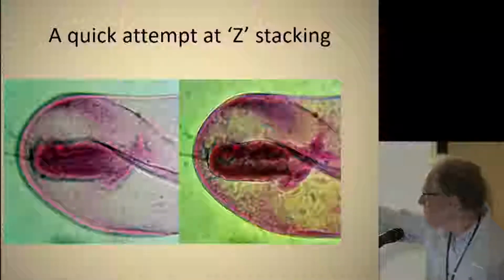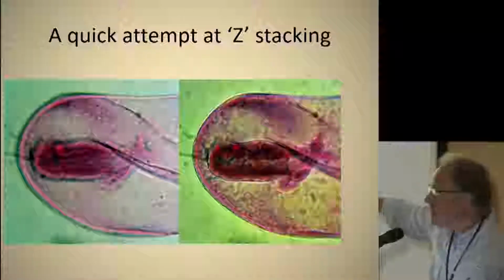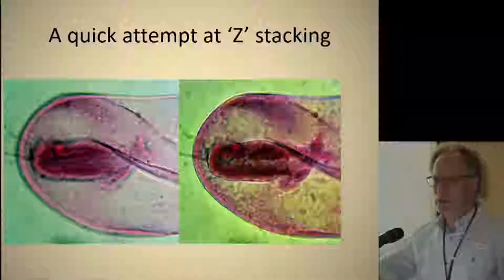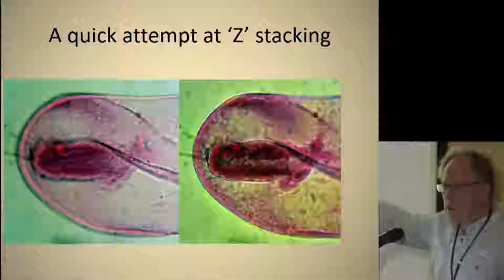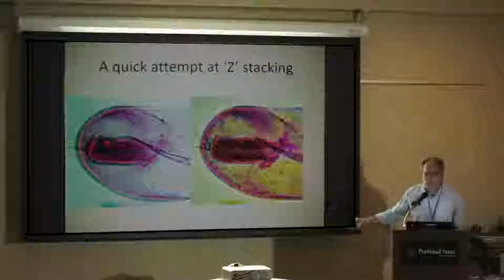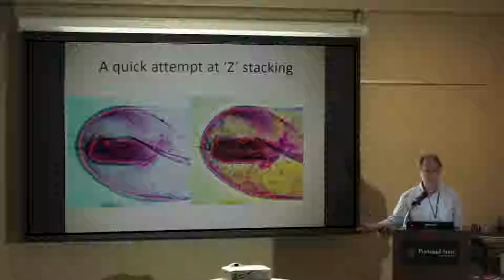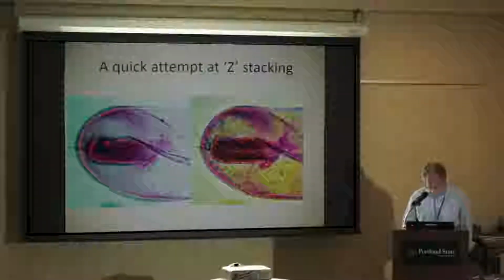On your left, we're looking at the archenteron, what eventually is going to form the gut. And this is a Z-stack with that really crude technique. Biology on a shoestring is what I'm left with most of the time. In this case, you can see clearly the archenteron. You can see the migration of the mesenchyme right and left that's going to make the mesodermal layer, and you can see the three-dimensionality of the exoskeleton already forming. For me as an embryologist, that's a much, much better image.